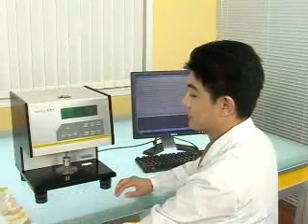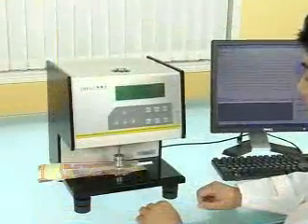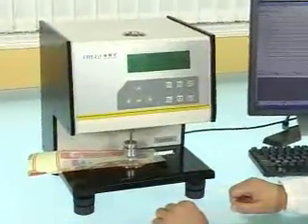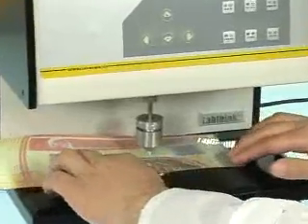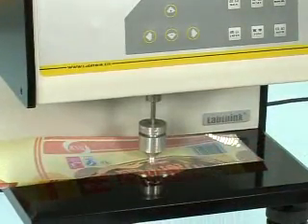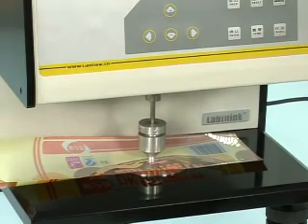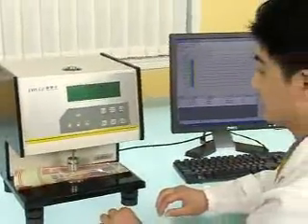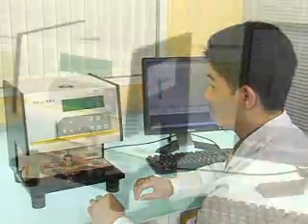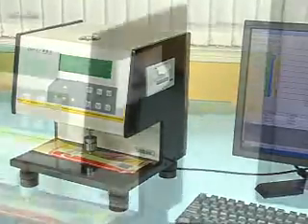Test the specimen at various points. The computer analyzes the test data. The system offers the maximum, the minimum, and the median values and prints out the test report.